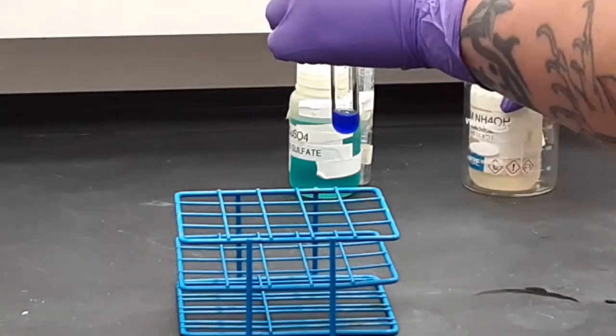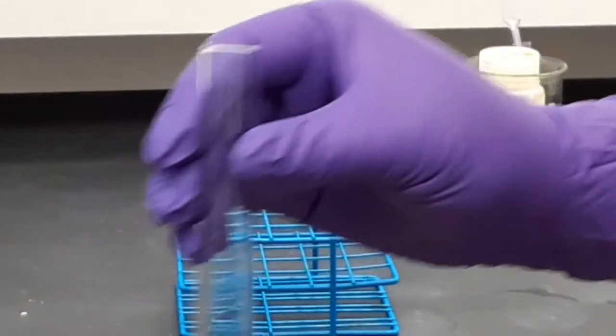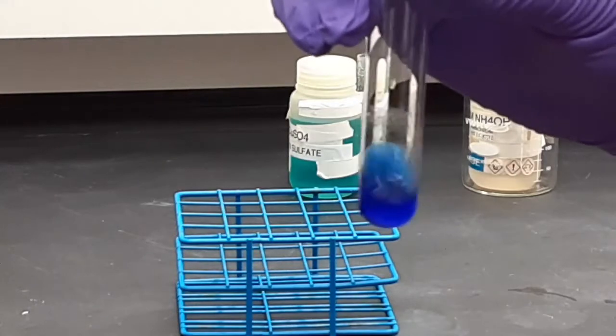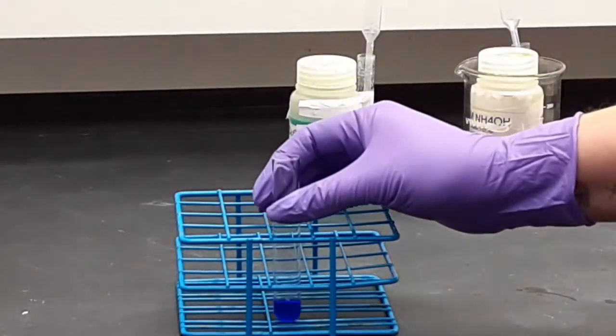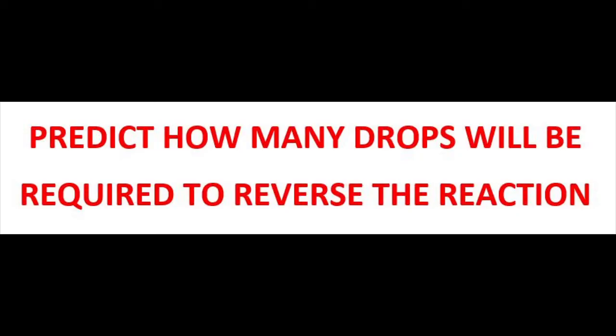I counted 13 drops. How many did you count? Now make your prediction.